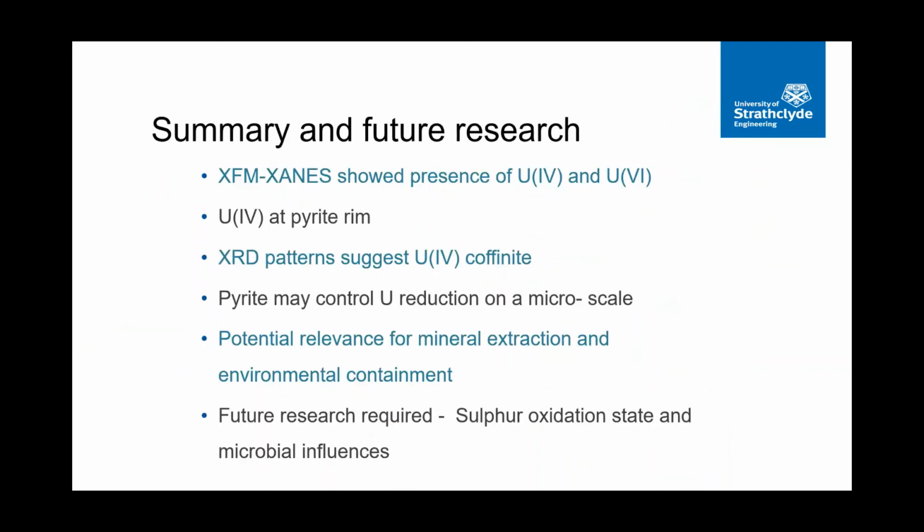In summary, and future research, some of this we've already said. What I didn't really touch on was the lack of sulfur data that we have to explain some of the processes going on, which wasn't available to me at the time of analyses. It would also be interesting to do some more microbial work with sulfur and pyrite, organic matter, and microbes.